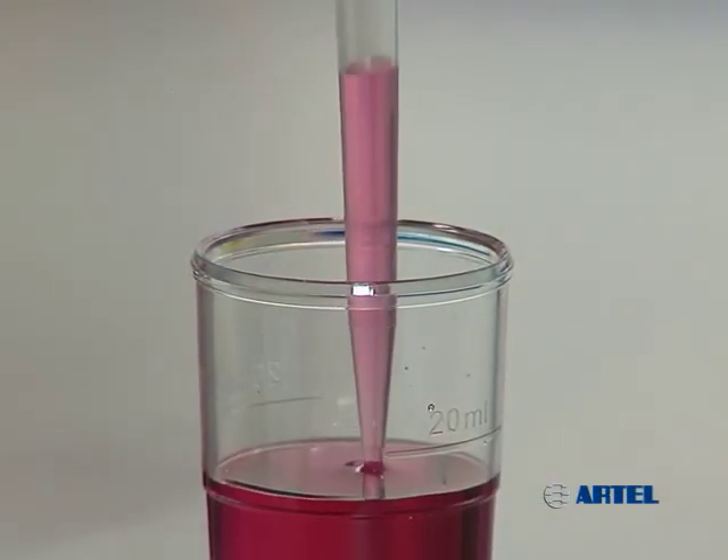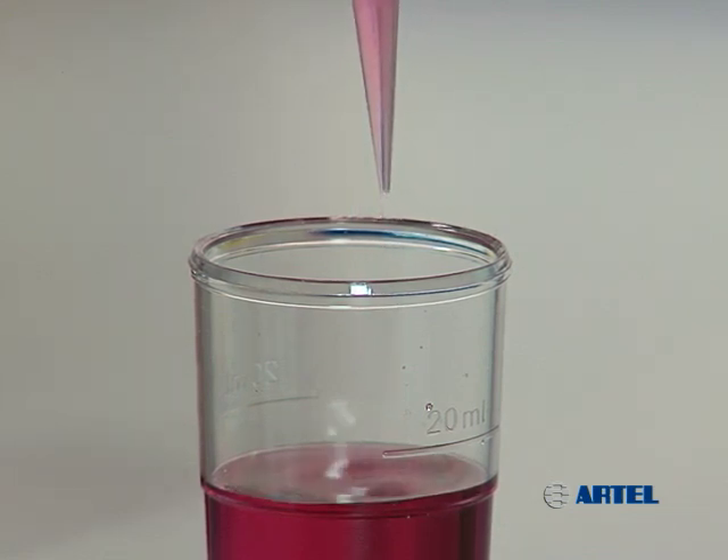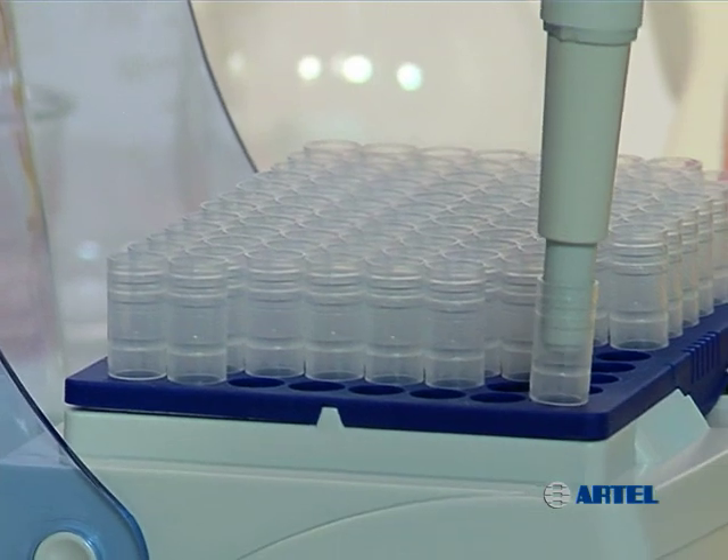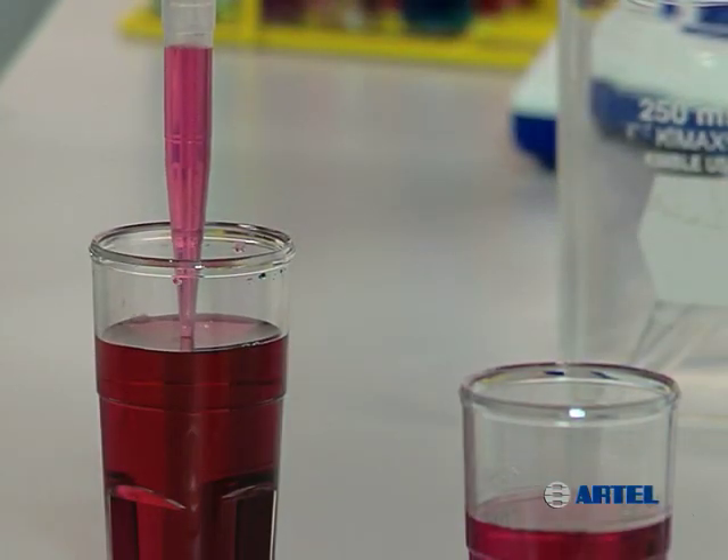Mismatching a tip and pipet, or using a poor quality tip, can result in inadequate seals between the pipet and the tip. Quality tips are flexible and have thin walls, providing an airtight seal and more dependable sample delivery.